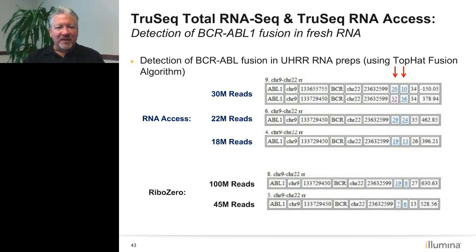Now, the one thing I want to highlight is that, as I said before, there is not a single probe in this probe set that explicitly targets BCR-ABL fusion transcripts, but we effectively capture the BCR junction on one side and the ABL junction on the other side, and when we capture those, we pull down the fusion as well.